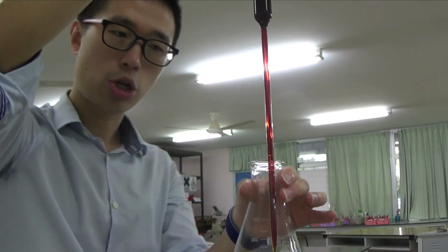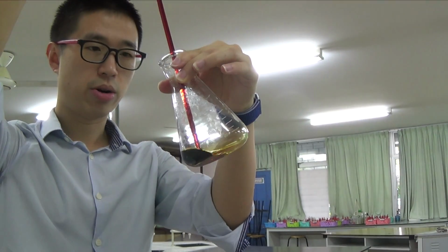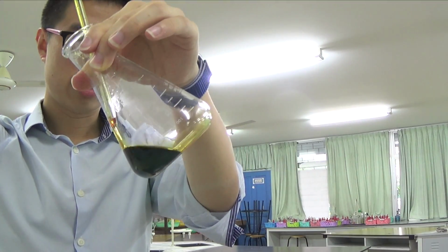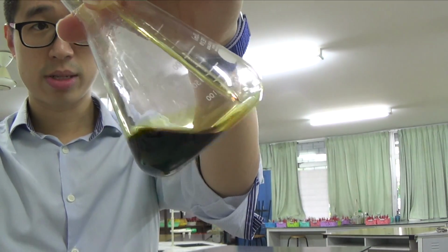Let gravity do its job, and you should be alright. Just down to the last couple of drops. 1, 2, 3, 4, 5, 6, 7.